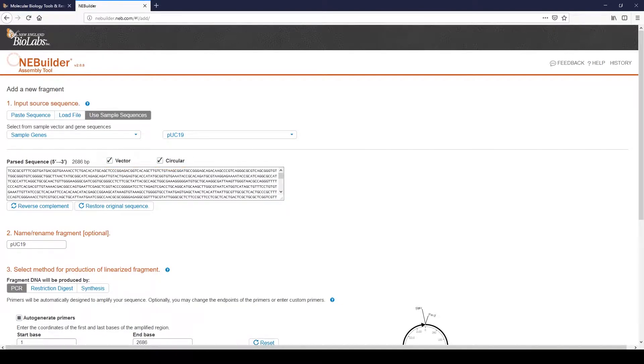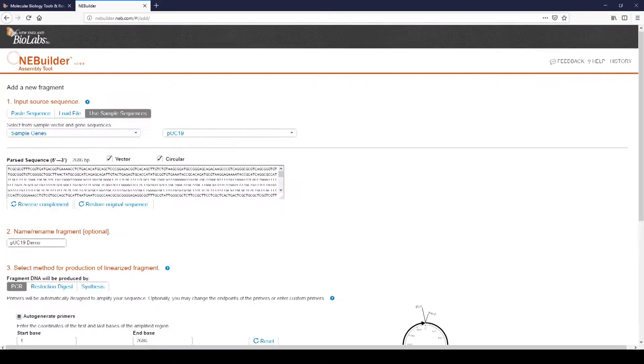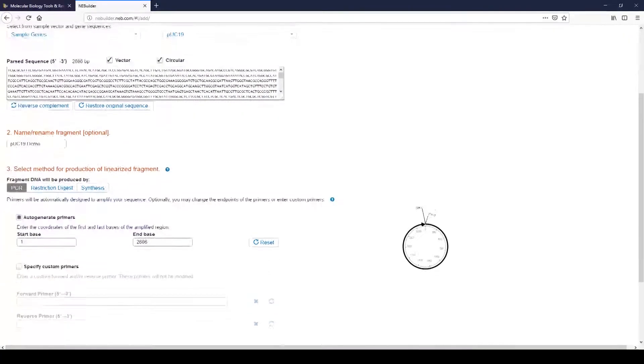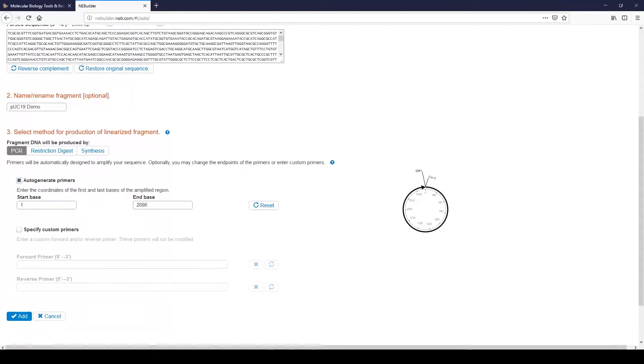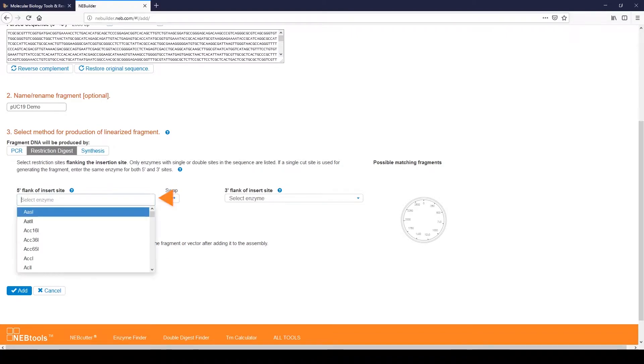Make sure that you check both Vector and Circular. In Step 2, name your fragment. In Step 3, select a method of production. In this example, we are using a fragment produced by restriction enzyme digestion. Now select the restriction enzymes that you will use to digest the plasmid from the drop-down menu. We have chosen HINDI-3 and ECO-R1.